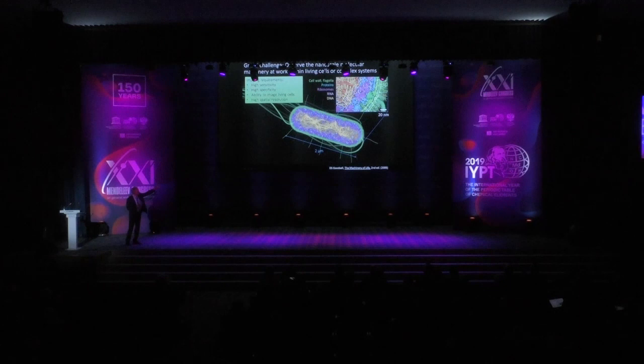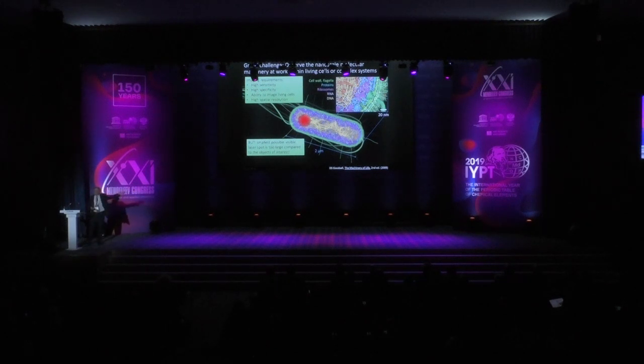Because look at the scale bar here. You see that little 20 nanometer. These objects are really tiny. So you might say, well, you could use electron microscopy, but in electron microscopy, all of this just becomes a fuzzy blur of gray and white objects. So you want some specificity, and that's what fluorescence does for you. It lets you label a specific set of molecules so that the light only comes from them. However, here's the problem. The smallest possible visible laser spot is too big compared to the size of all these objects. The diffraction limit, again, is limiting it.